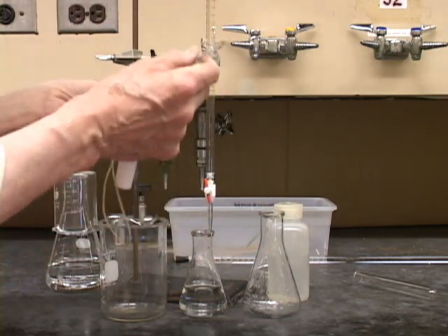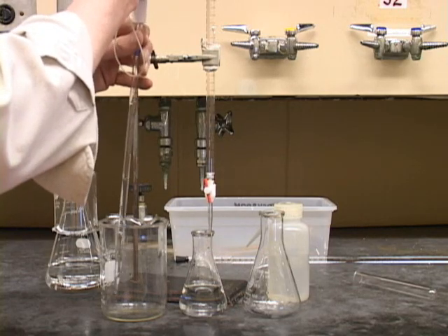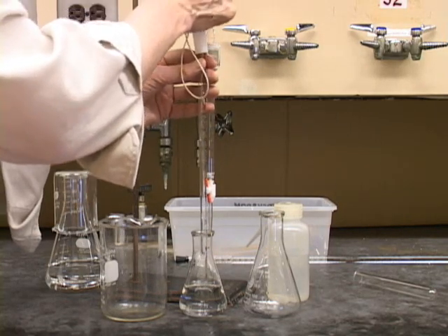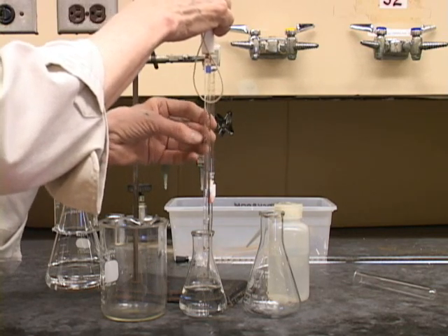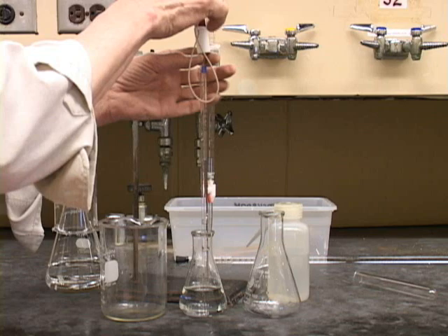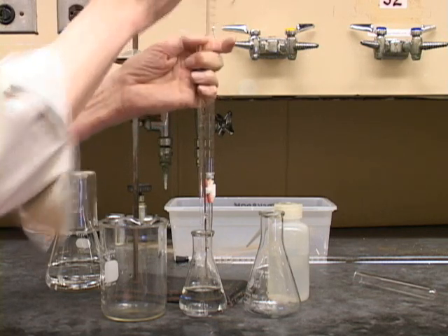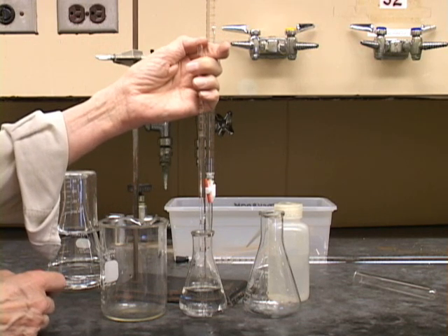Get this rinsed out and put it in a waste bottle here, the slop bucket. Now for keeps, we will draw this up. There's the 0 mark up here. And we're drawing it past the 0 mark. We'll bring it right down to the 0 mark.